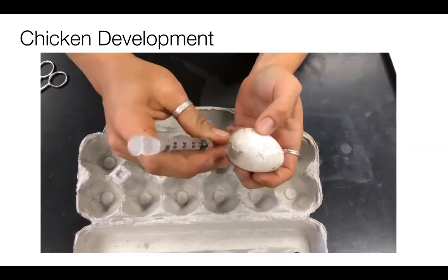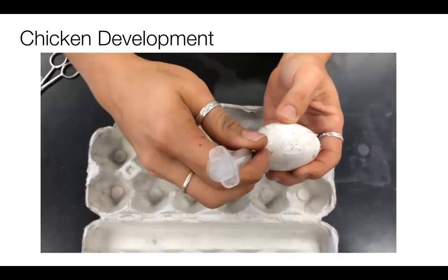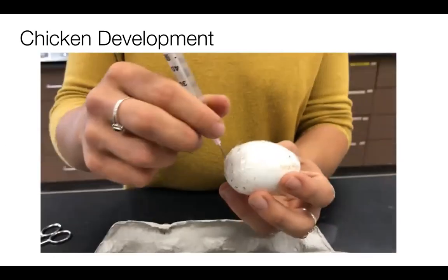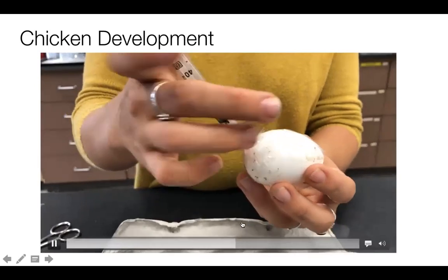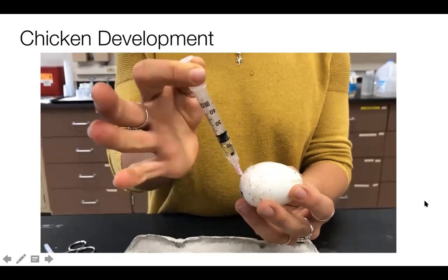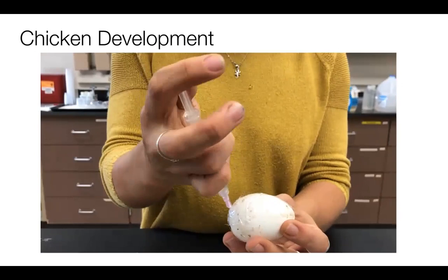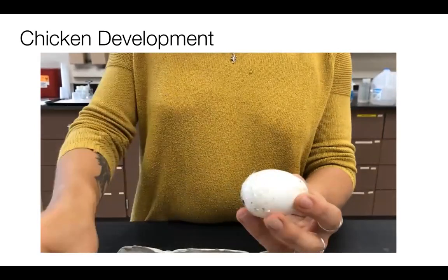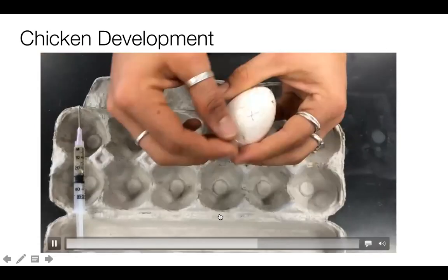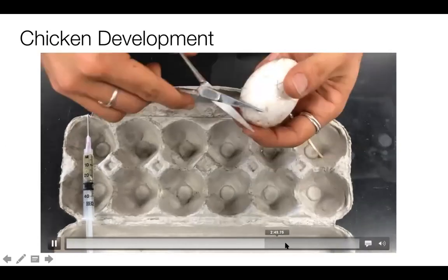And there, I've cracked my way in. Took me a little longer. Now that you're in, you want to keep making sure that your needle is at a diagonal. Then you're going to insert it all the way. Pull a cc of albumin out, the white clear liquid. It should only look white and clear in the needle. We're going to take about 1 cc out. Put that down. You'll take another piece of tape and place it over the hole that you made, the incision mark. You don't need a big piece of tape.